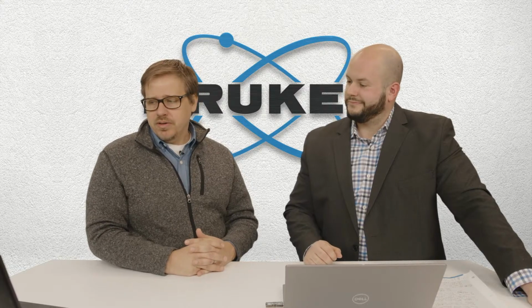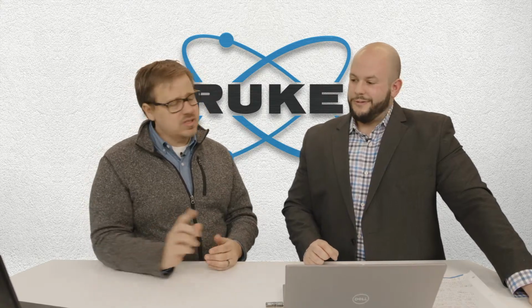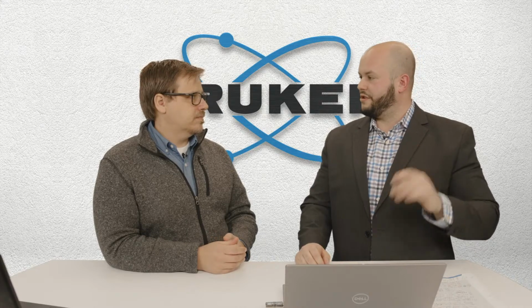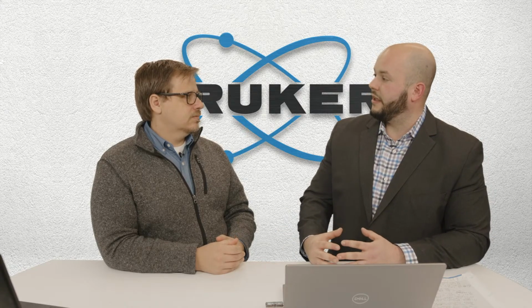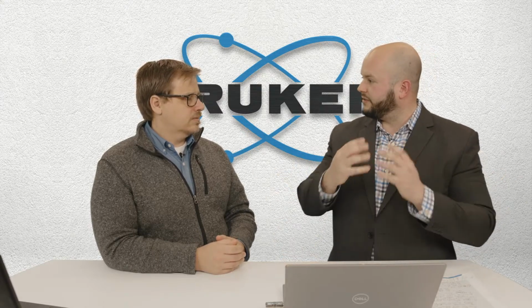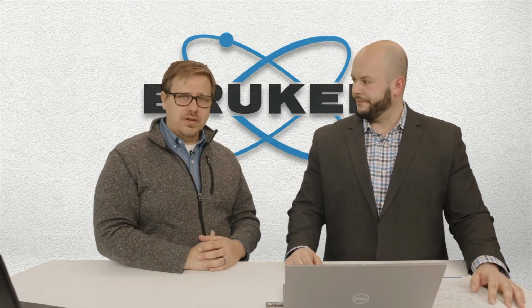One other question that had come in is, can this be automated? I think they meant the analysis. Yeah, and that comes from Steve. Great question, Steve. There's a whole workflow section in the software. The manual does a very good job of going over tutorials on how to set that up. As you've seen in some of the stuff that we've done today, you can pull in pre-saved sample information, stuff that you can add to the database to help move that automation along, and then workflows to pull it all together. The workflow is going to be something very visual. You can put in these blocks of the different things. You can record them, in fact, and it's going to give you a simple walkthrough of doing the analysis.